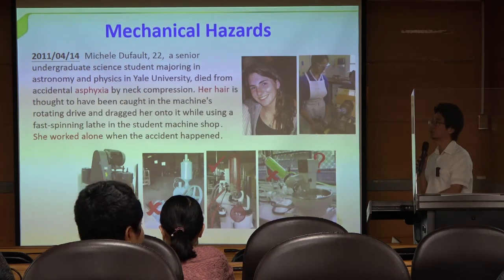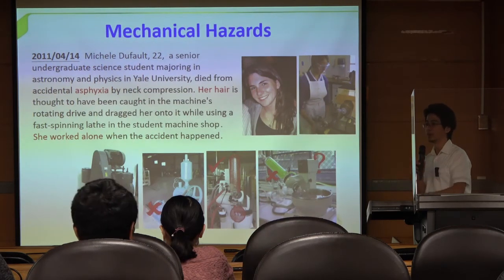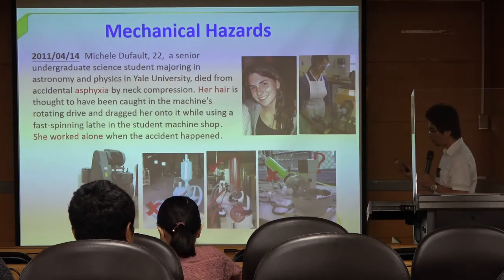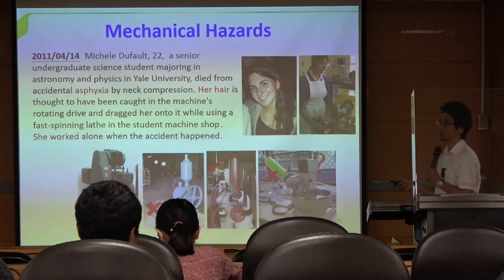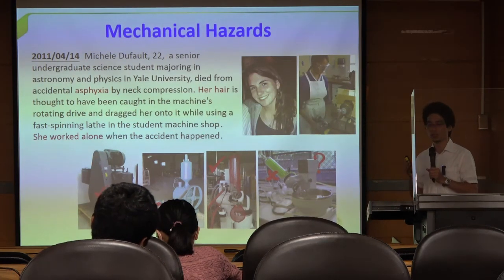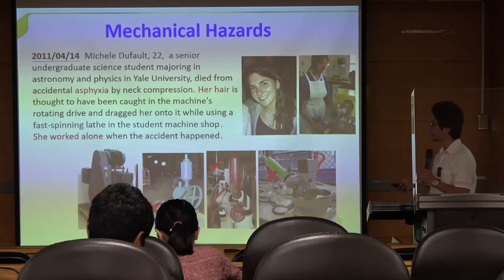If you want to do your experiment at 10 p.m., tell your coworkers you will do the experiment at 10 p.m. Then they will know you are doing the experiment in the laboratory. Do not work alone in your laboratory, especially in the evening. It's very dangerous for you. If something happens, there's not enough time and enough personnel to help you.